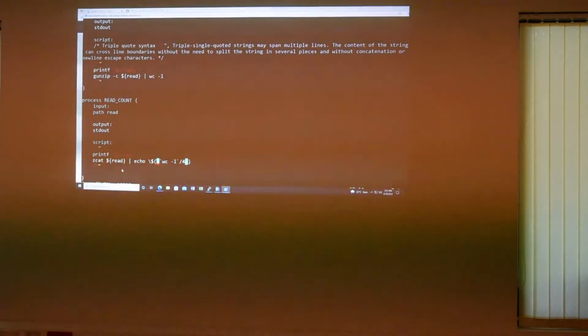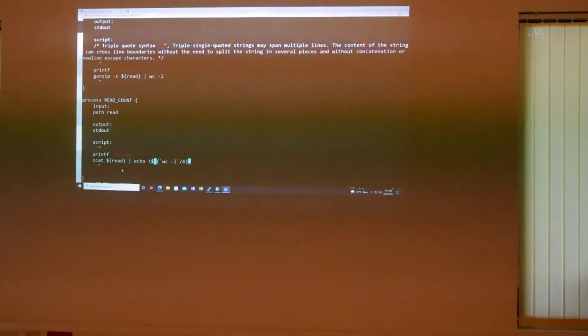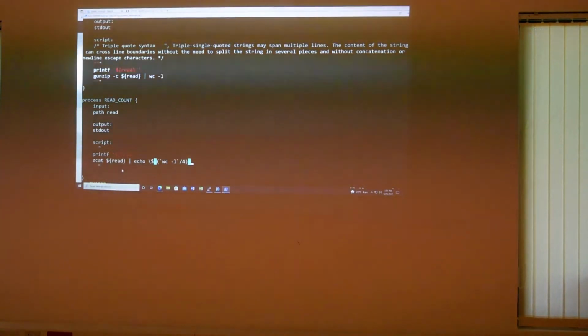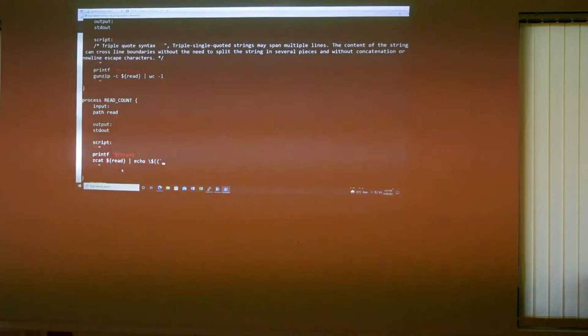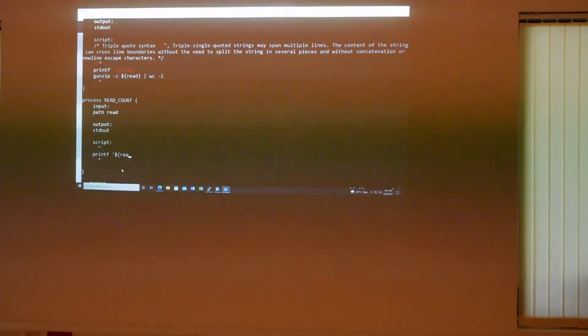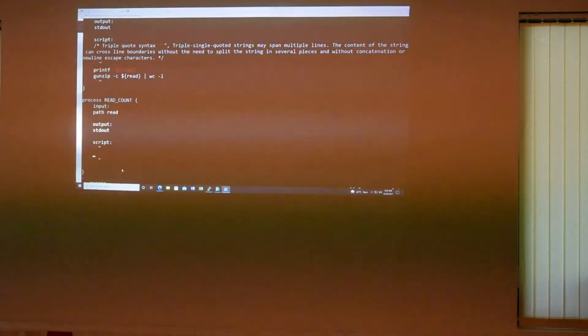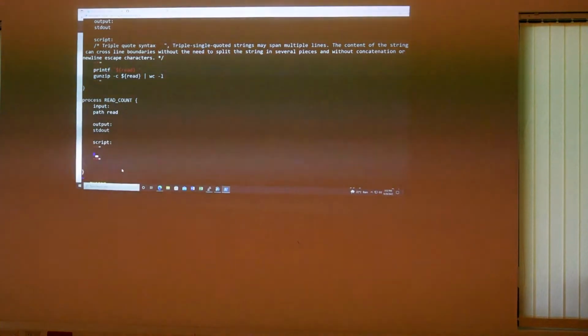You can still do that in Python. I told you you can still do the number of read count in Python by implementing that in a Pythonic way.